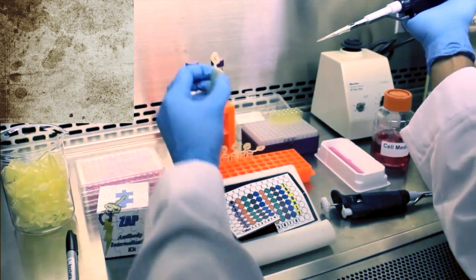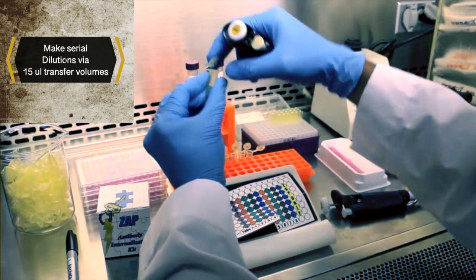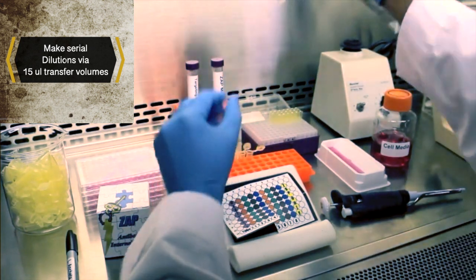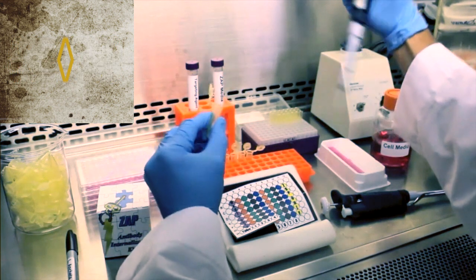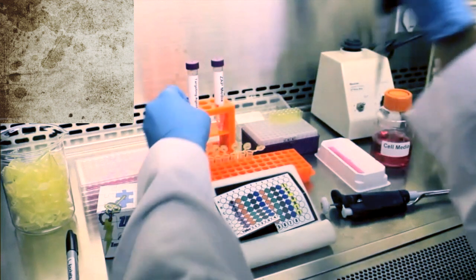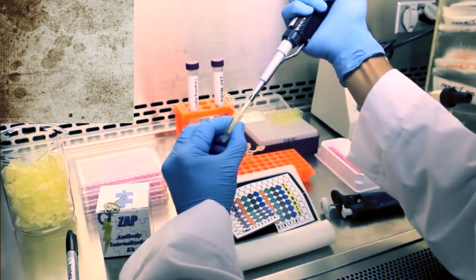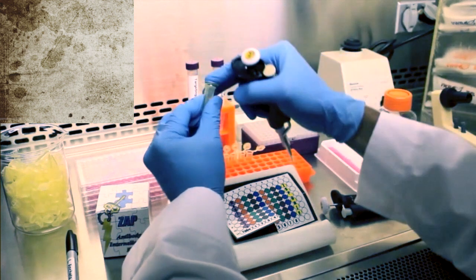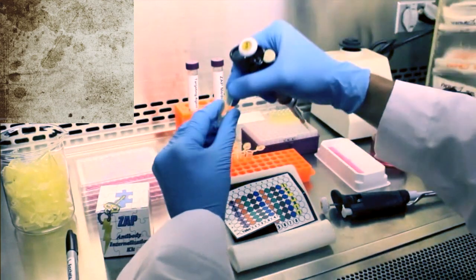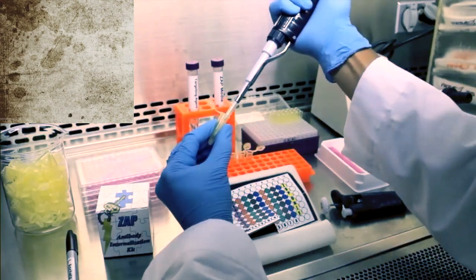Perform serial dilutions by pipetting 15 microliters from tube 1 into tube number 2. Pipette up and down several times to mix. Vortex the tubes briefly. Repeat by pipetting 15 microliters from tube number 2 into tube number 3. Continue to repeat these steps through tube number 8.